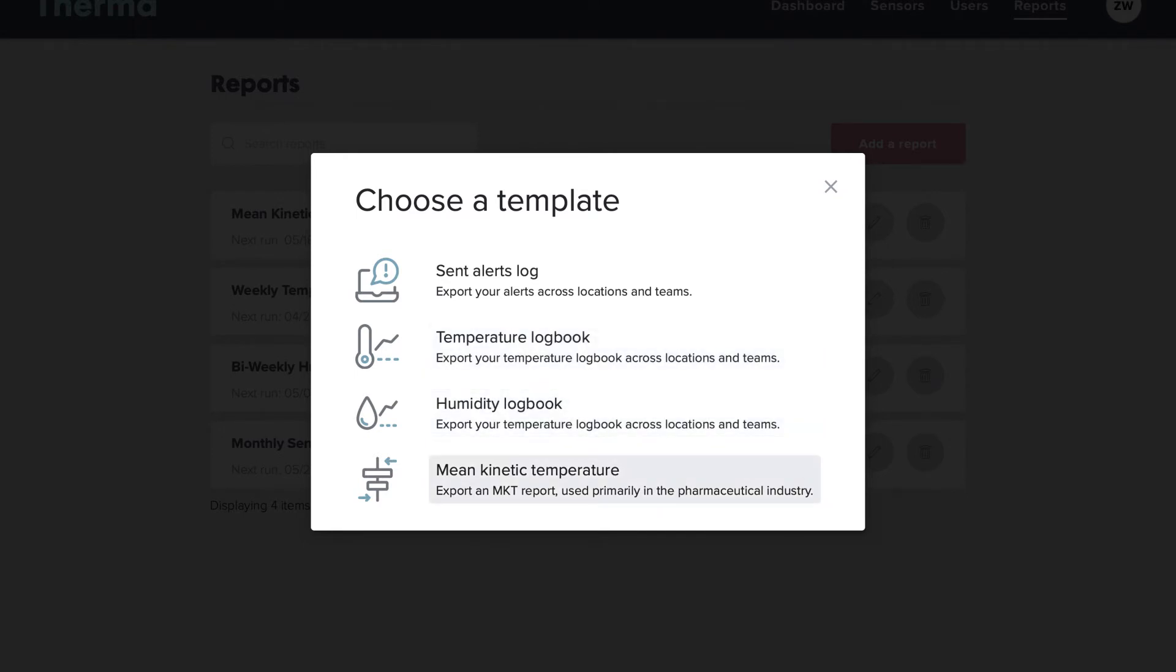Mean Kinetic Temperature is a way of expressing the impact of temperature fluctuations over time, primarily used in the pharmaceutical industry. This report also includes min and max temperature.